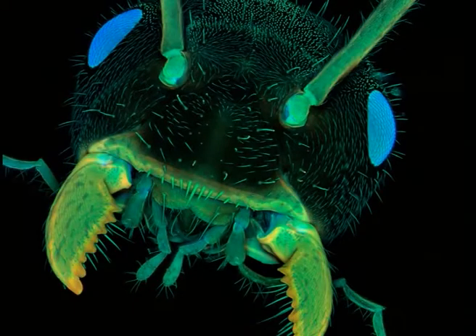A photomicrograph can be taken in both black and white as well as in color. Color photomicrography is rather complicated as compared to black and white photography. The film for color photomicrography is coated with a special emulsion.